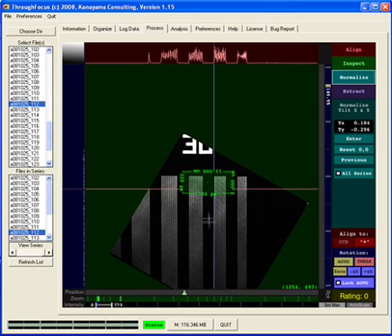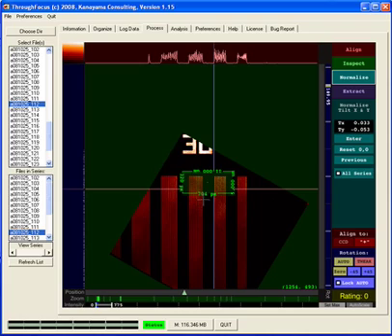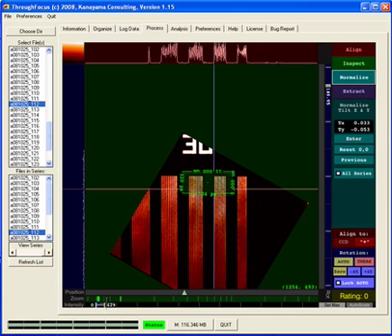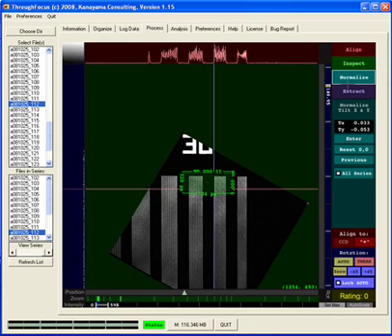Sometimes it's easier to do this when you can see some color in the image. This is where you control the color right here. So right now it's on a black and white or grayscale. If I click once, blue are all the zero values. This is a red scale, very convenient to use sometimes. I can also change the intensity here to make it look a little bit different. There's a rainbow scale, and there's another scale that makes it look like a resist image. It's either black or white. Okay, so back to grayscale.